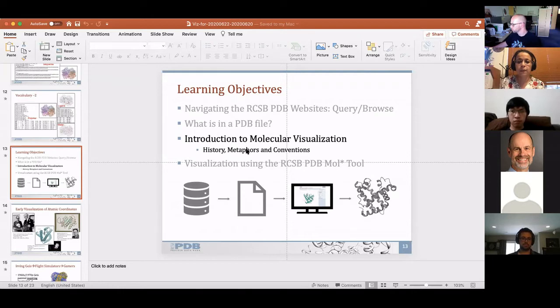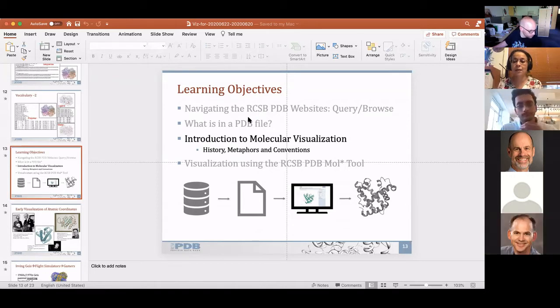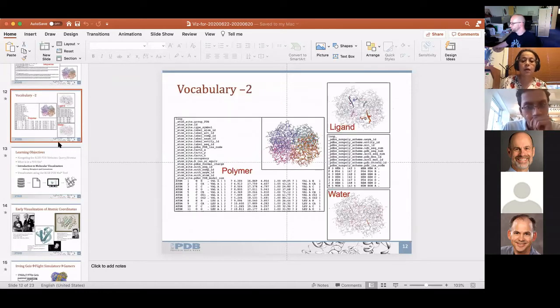Stephen Mills. Sorry, I raised my hand separate from that question. I'm looking at one of those mmCIF files real quick, and it looks like the XYZ coordinate part of the data is pretty much the same as it was in the old style, and it's mainly the header that's different in the two different formats. Am I about right?